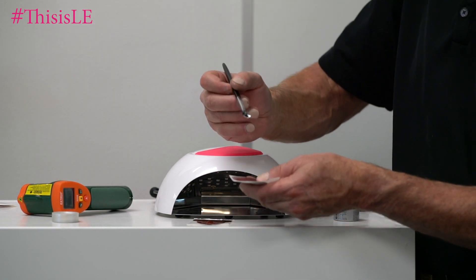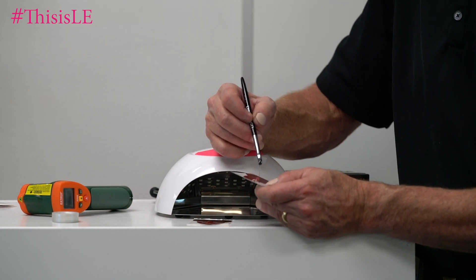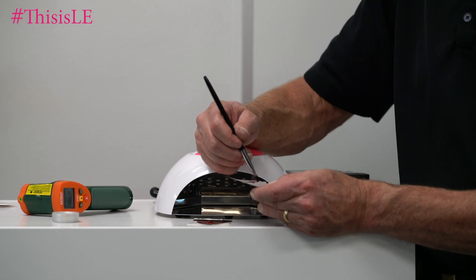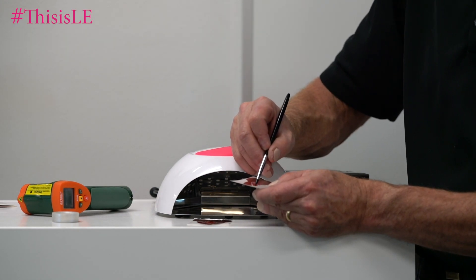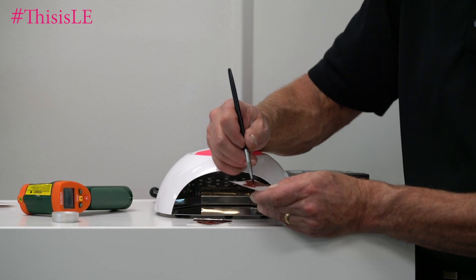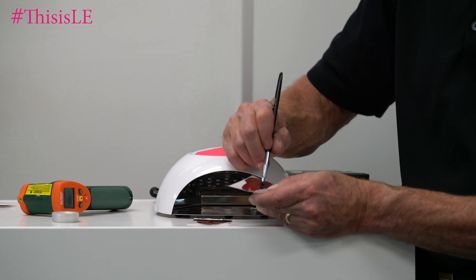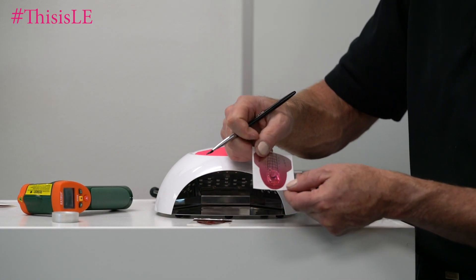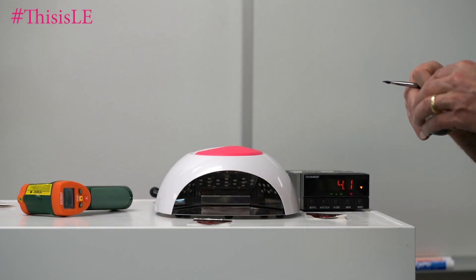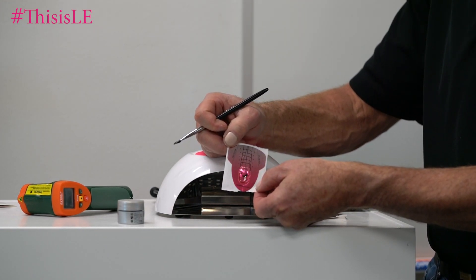We determined that 0.25 grams of gel was the proper amount based on how thick that gel is on top of the form. So if you're doing a fill or even a full set in two or three applications, 0.25 grams on a full nail for a full extension — the length of that cutout seemed to be about the right thickness. So that one is going to sit there; I'm going to tuck it behind the light. And now we have the gel right there.